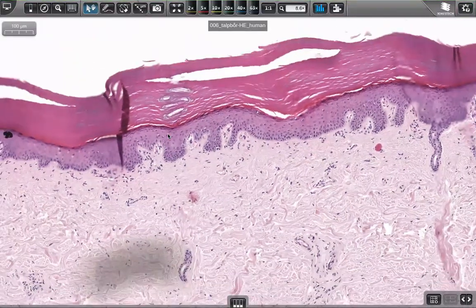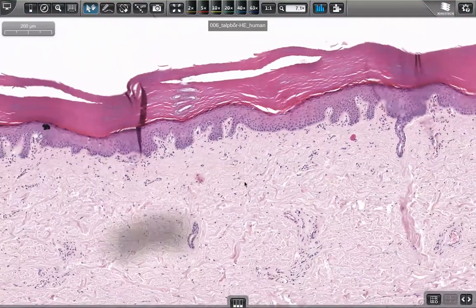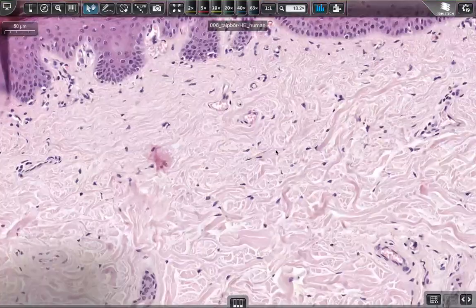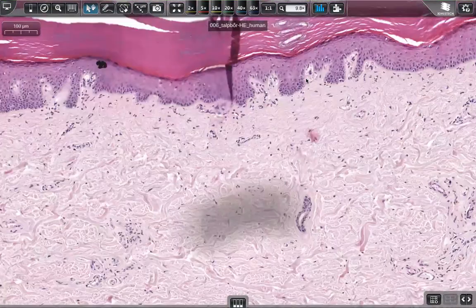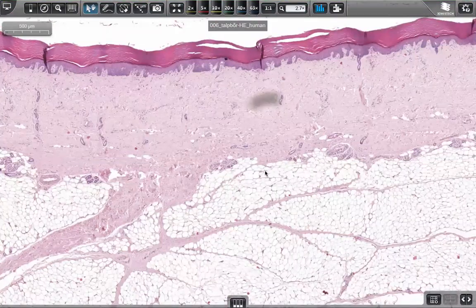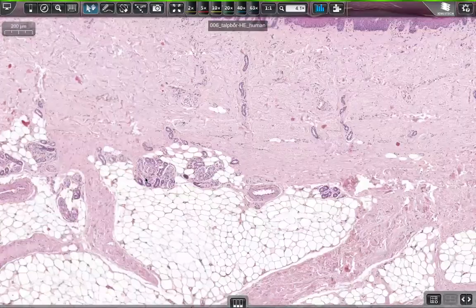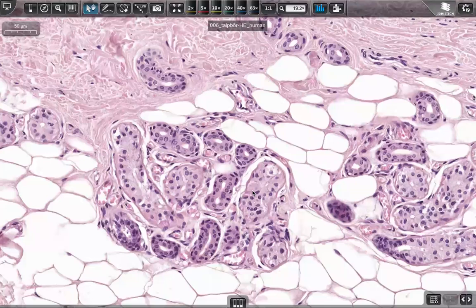Under the epidermis we have the connective tissue elements with coarse collagen bundles and fibrocytes. So these are fibrocytes, and here we have the collagen fibers. And in the dermis, beautifully seen, are these units. These are merocrine sweat glands. These are the excretory portion, and these are the, sorry, I mixed.